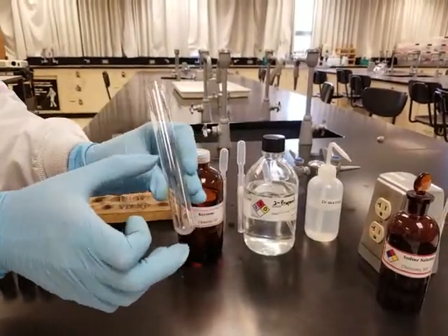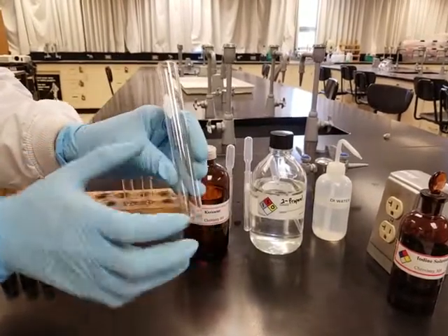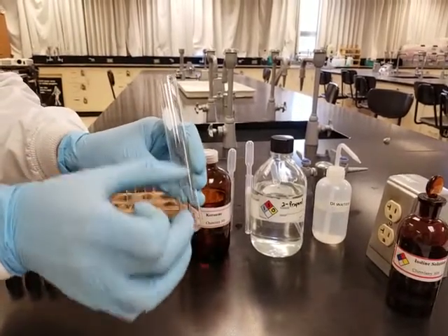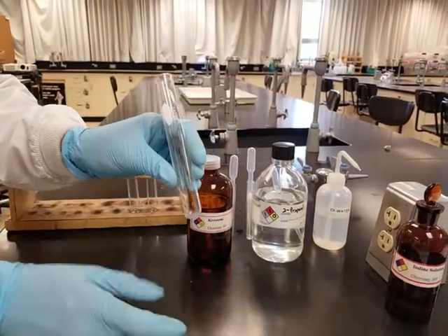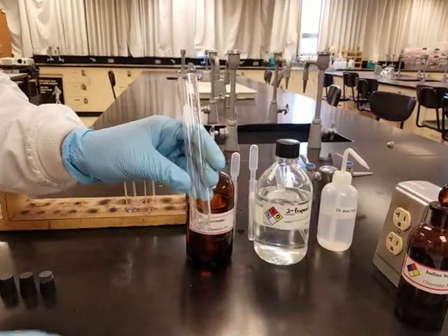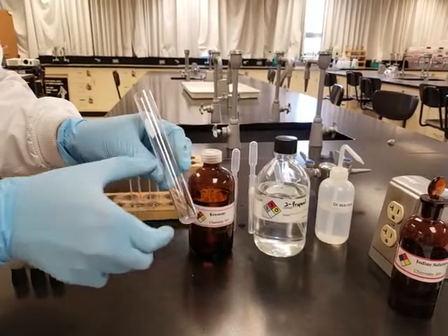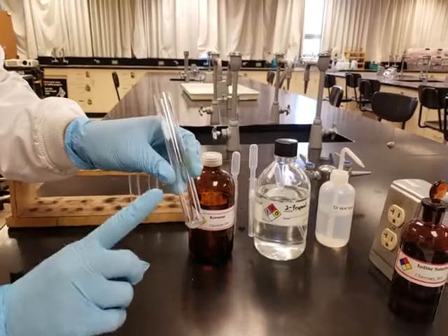Is it going to be one homogeneous liquid, or are you going to see two separated liquids? If they don't mix, you're going to see two separated liquids. If they do mix, then you're going to see just one homogeneous solution with no interface in the middle.